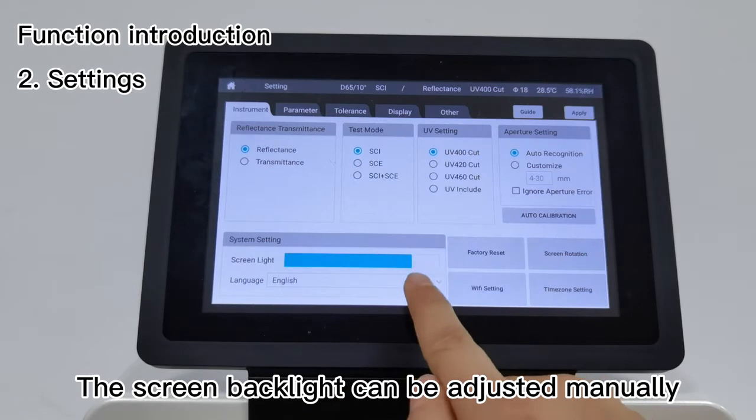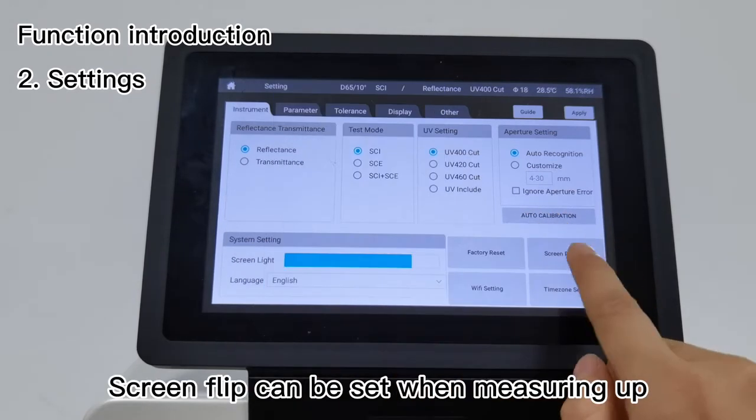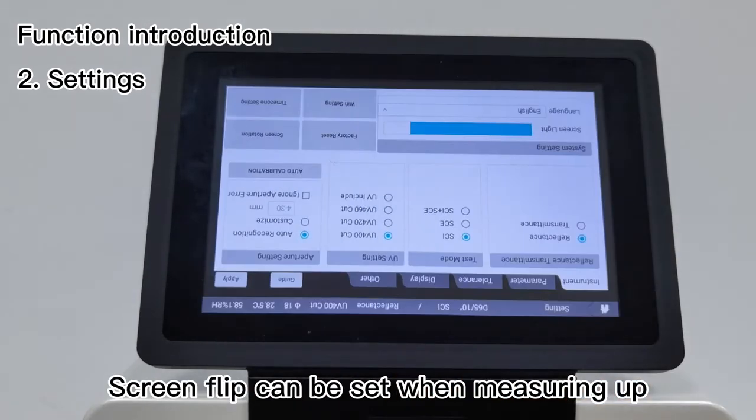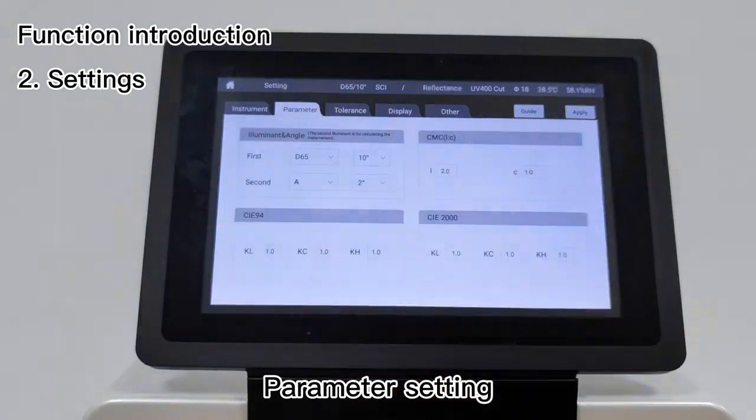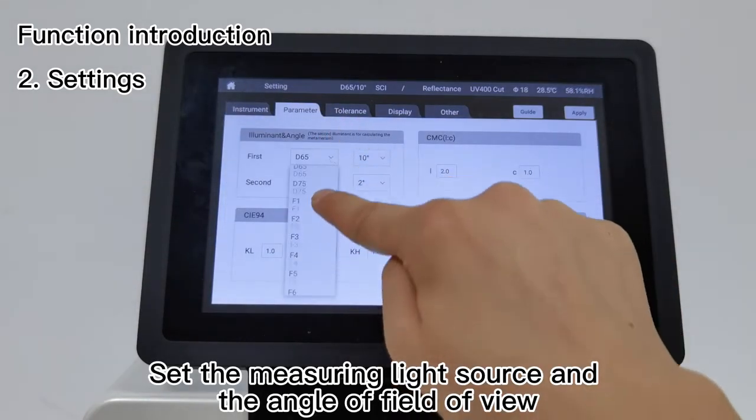Set language, screen flip can be set when measuring up. Parameter setting allows you to set the measuring light source and the angle of field of view.